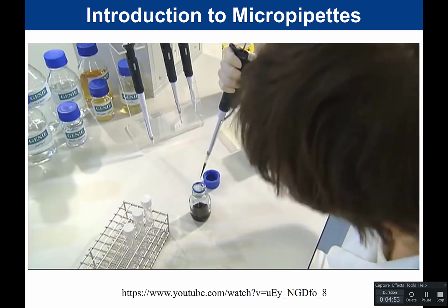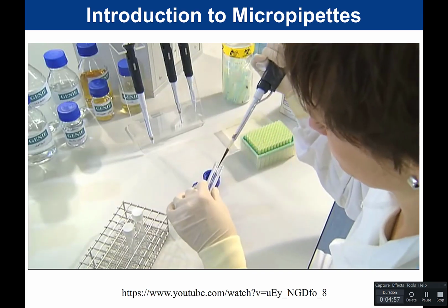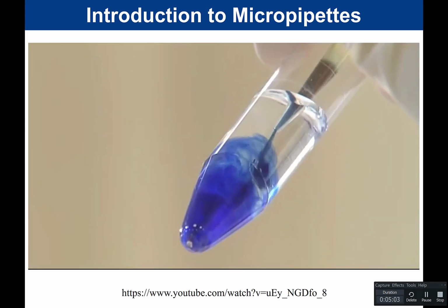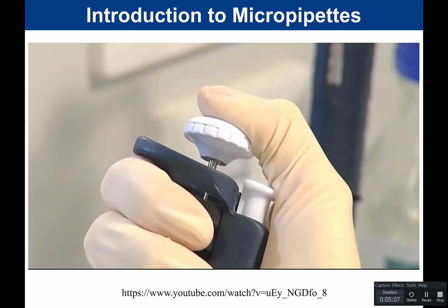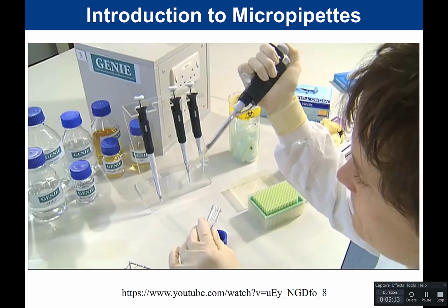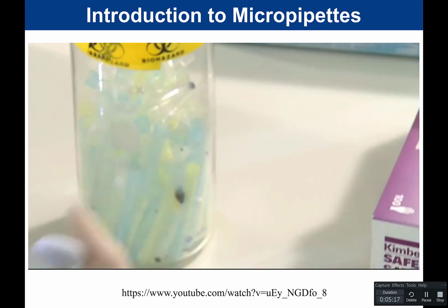Withdraw the pipette tip from the liquid and place it inside the recipient container. Slowly push down on the push button. This will release the liquid in the pipette tip into the tube. This time push beyond the first stop. This ensures that any residual liquid is expelled from the pipette tip. Fully withdraw the pipette tip from the liquid before you release the push button.